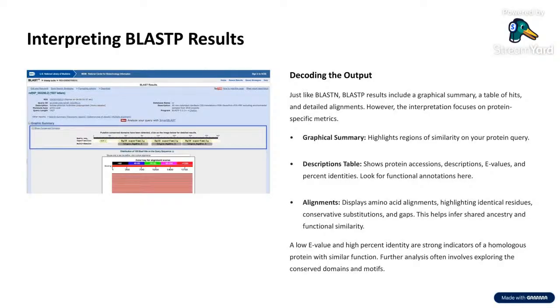For example, suppose you are comparing a plant transcriptome from an ancient fern to a flowering plant database. The DNA sequence may have diverged too much for BLASTN to find a match, but using TBLASTX, which compares translated protein contents, may reveal hidden homologies.